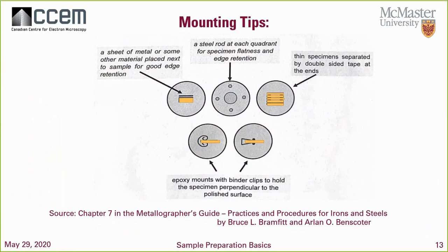But if you are going to be doing any chemical analysis, please be aware of the material that you have added to your specimen, right? In terms of coating or in terms of the particles that you added to your mount, right? So let's say you combine your epoxy with a nickel powder, you want to make sure that you keep in mind that now you have nickel in your surface.